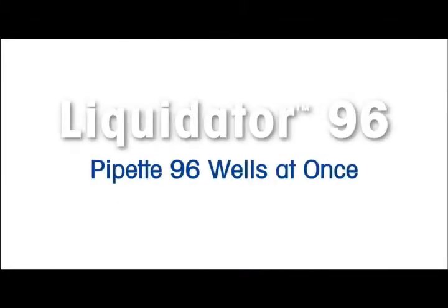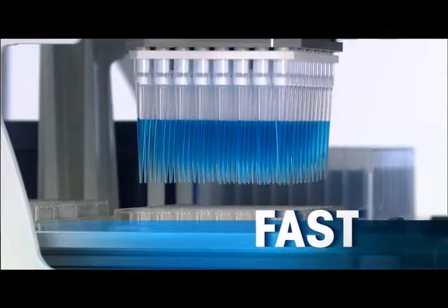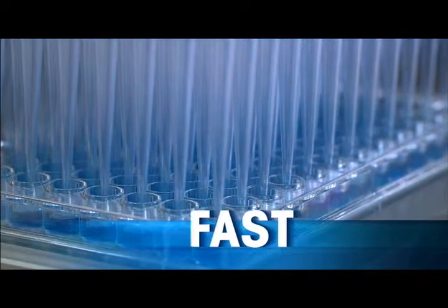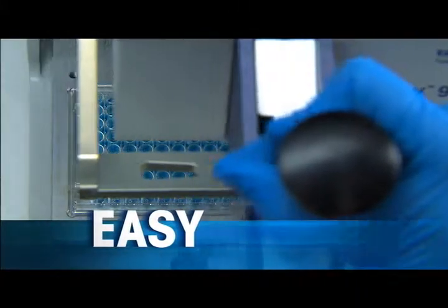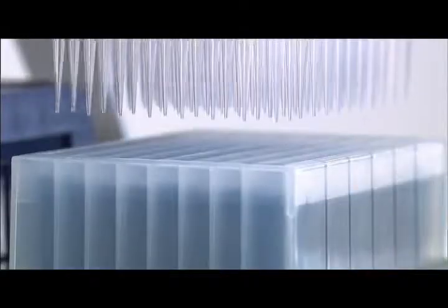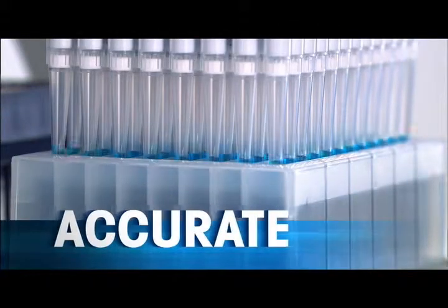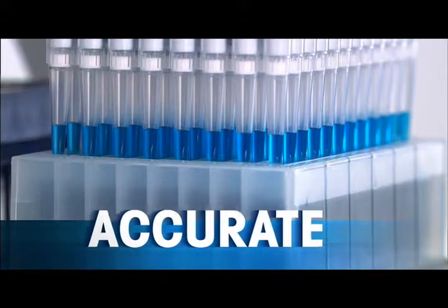The Liquidator 96 is a compact manual benchtop pipetter. It's fast. Now you can manually pipette 96 wells at once. Easy, with the simplicity of a manual pipette. Accurate, with consistent delivery and high throughput.